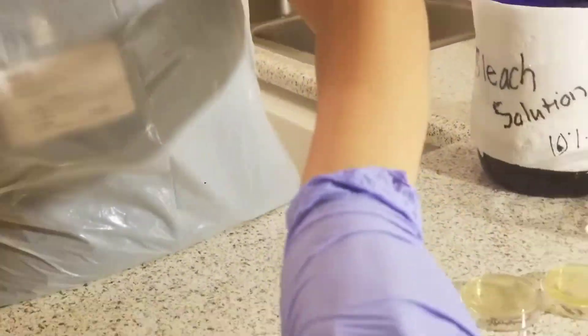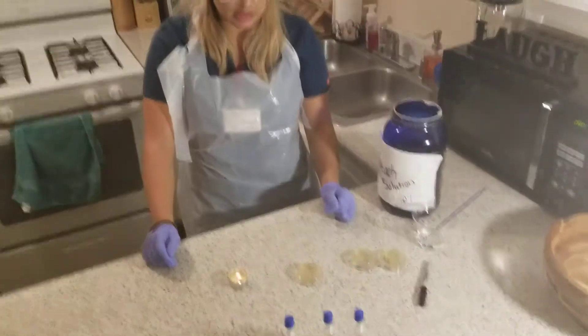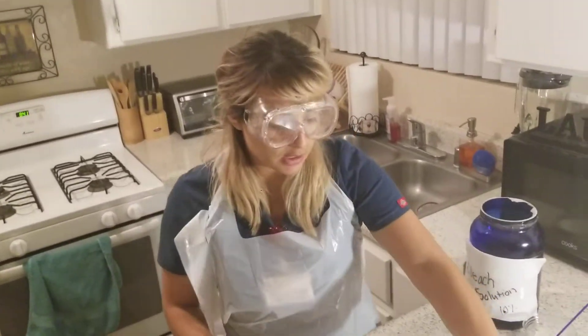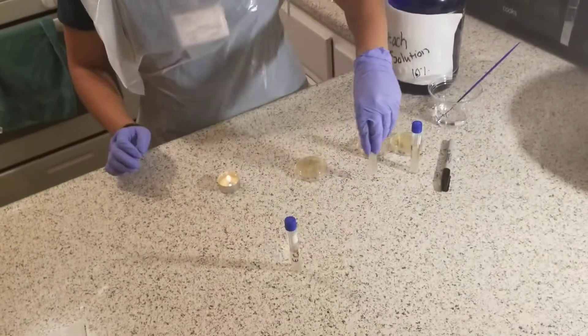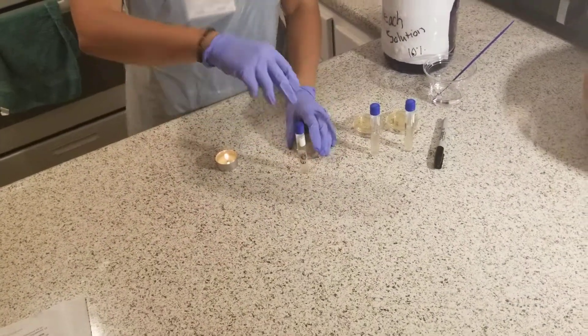In this experiment, what I'm going to be doing is isolating individual colonies, so I'll be creating a streak plate for each microbe. I've already completed the first two, and then I will be showing you how I'm going to do the last one, which is the E. coli.